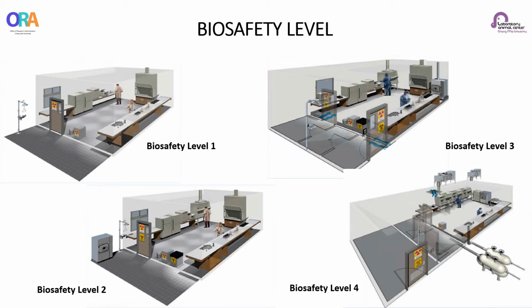The secondary barriers for BSL-3 laboratories include those previously mentioned for BSL-1 and 2 laboratories. They also include enhanced ventilation strategy to ensure inward directional airflow, controlled access zones to limit access to only laboratory-approved personnel, and may contain anterooms, airlocks, exit showers, and exhaust HEPA filtration.